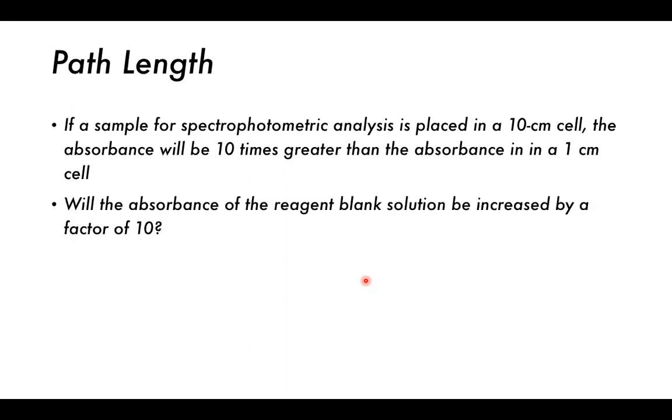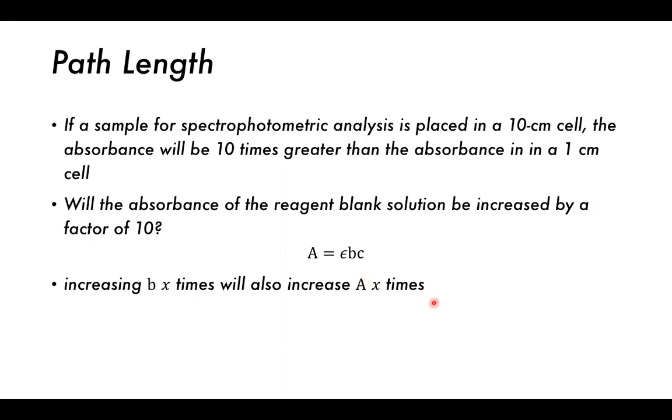So will the absorbance of the reagent blank solution be increased by a factor of 10? Here we have A equals epsilon BC, where B is our path length and A is our absorbance. Increasing B X times will also increase A X times. So yes, it will.